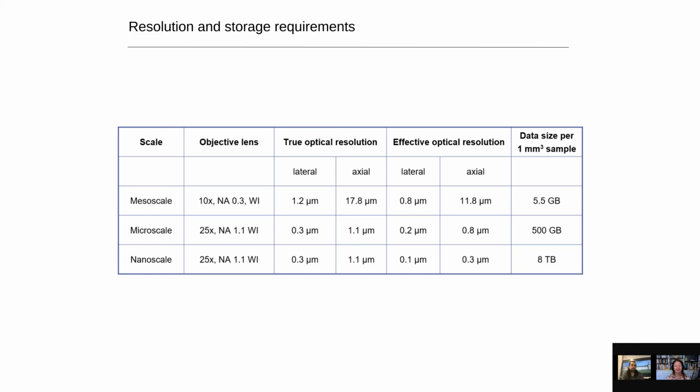Frozen or not frozen? No, at 4 degrees. You cannot freeze the sample because you have a polymer gel that is filled with water. If you put that at minus 20, it will crystallize and everything is gone.